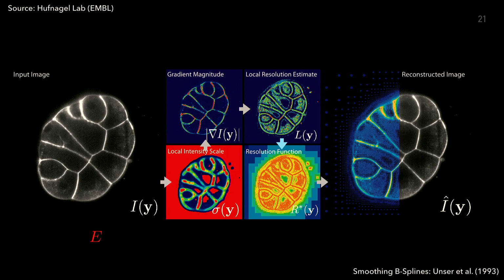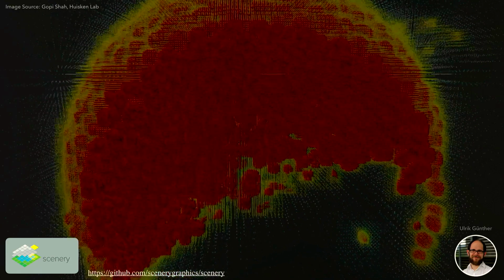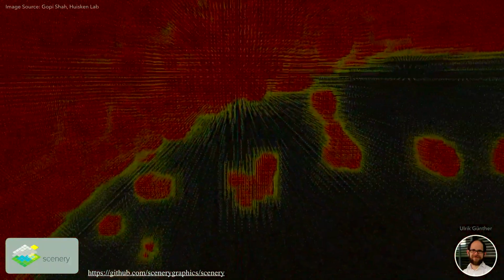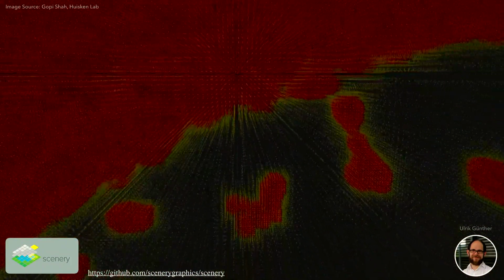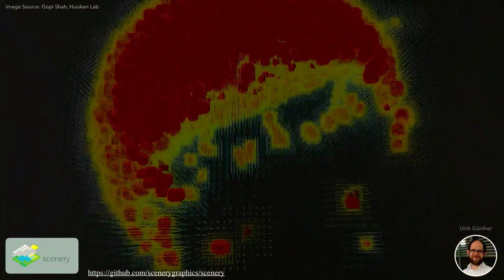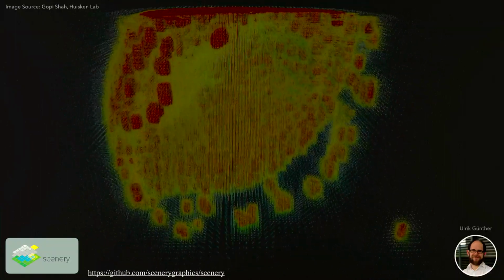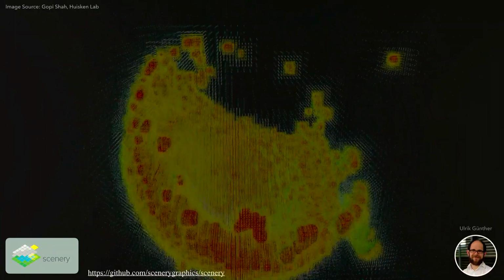And of course, this is not just in 1D or 2D slices. It also works in 3D. This is a 3D video showing how, in red, is pixel resolution, and yellow is going down to the lower sampling, homing in on the content in 3D. What you'll probably be able to see better is this example.